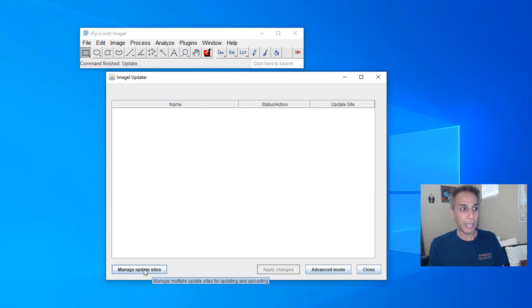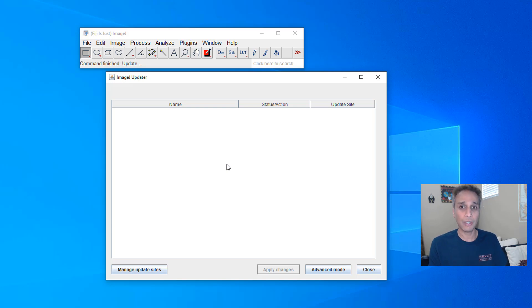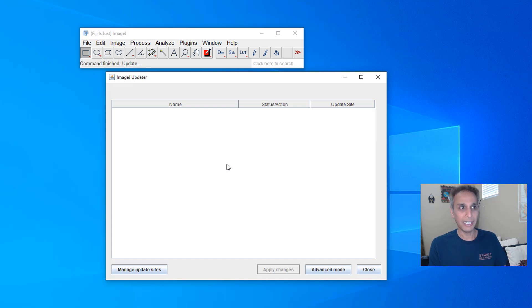But at the bottom you see manage update sites. This screen may not show up if there are actual updates to your ImageJ so go ahead and do that process and fire up ImageJ again and then do the process again.